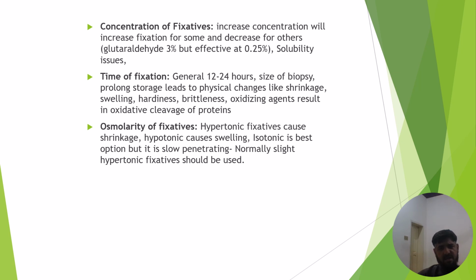Similarly, osmolarity of the fixative is also one of the factors that affect fixation. For example, hypertonic fixative causes shrinkage, hypotonic causes swelling. Isotonic is the best option, but it is slow in penetration. So normally a slightly hypertonic fixative should be used for the purpose of fixation.